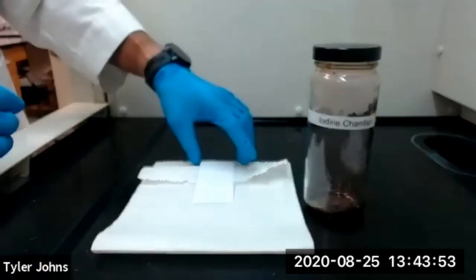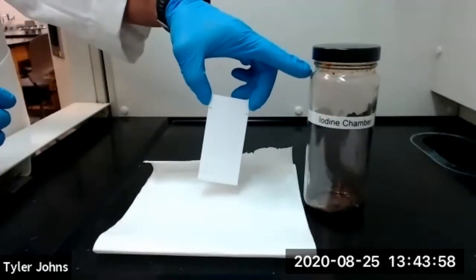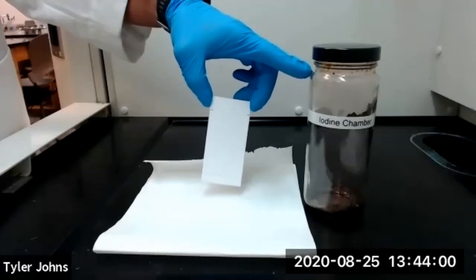Once our TLC plate has completely dried, we'll place it in an iodine chamber until the spots begin to appear.